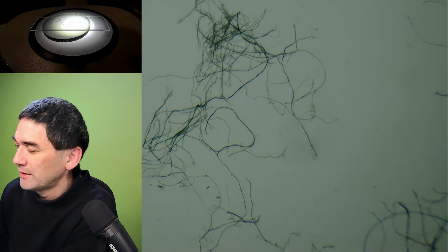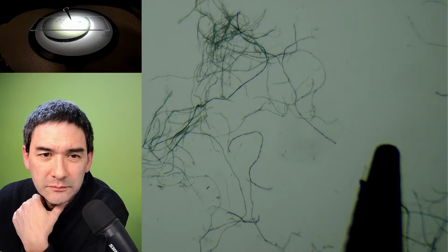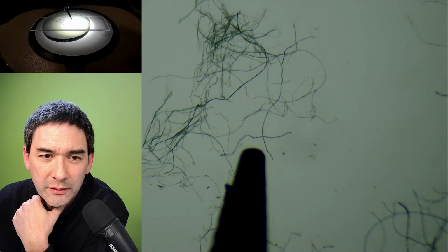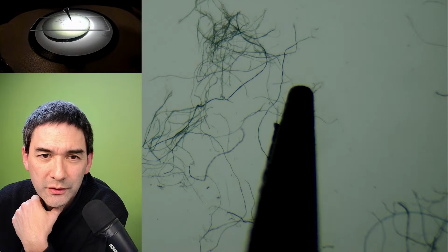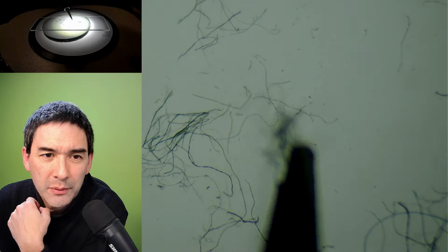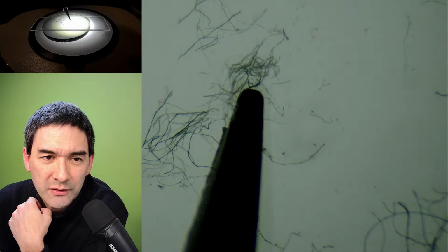Okay, let's try this here again. This one over here. No, see? It does not seem to respond so much. Oh, okay, now it got stuck.